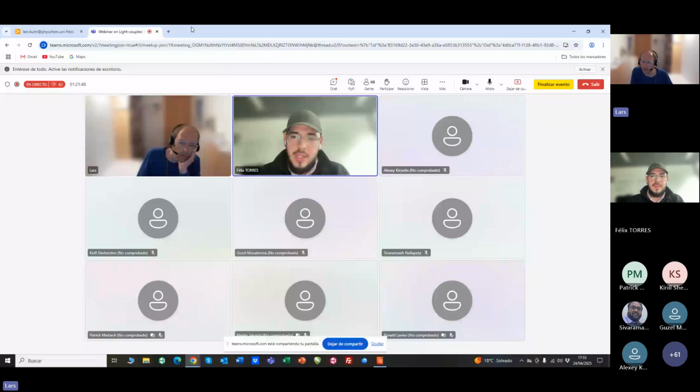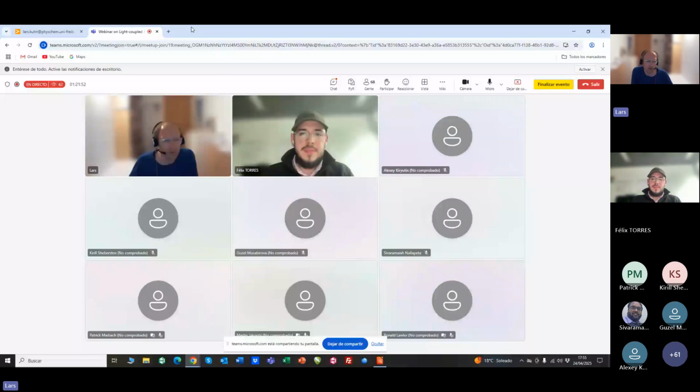Well, the oxygen, of course, you wonder because oxygen can quench triplet flavin. Is that the reason why you're asking? There are always two things about removing oxygen from your solution. On the one hand, it's a triplet oxygen, so it's a radical in itself, so it might quench the amount of triplet flavin available in solution. But at the same time, it also prevents the regeneration of photoreduced FMN, which of course leads to photo-bleaching.